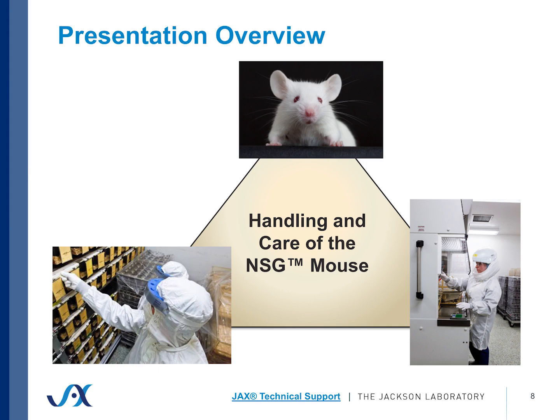The first is obviously the mice. They're the functional unit of the breeding colony, or the functional unit of your experiments, the key host in some cases, or it could be the model that you're working with. Obviously, the biology that's inherent in that mouse, what mutations do they carry, what transgenes, what kind of phenotypes do they develop. This is all very important to understand so that you know the best way to handle them. How do they breed? What kind of support do they need? What kind of care? What kind of veterinary attention?